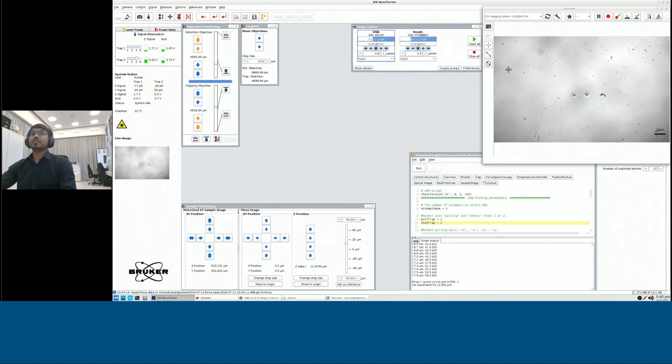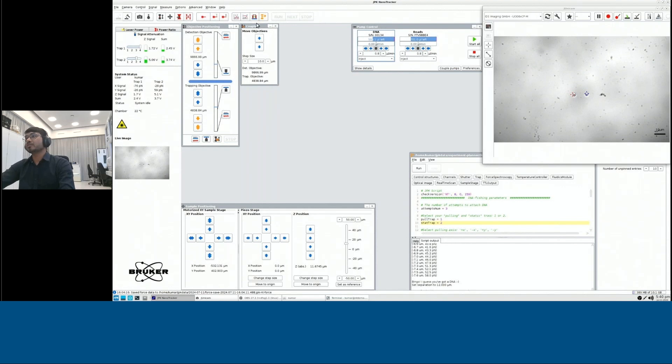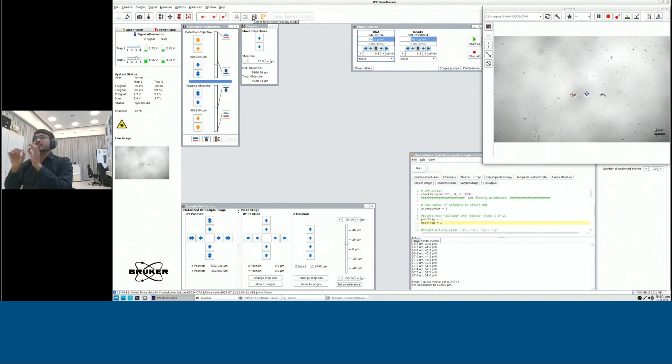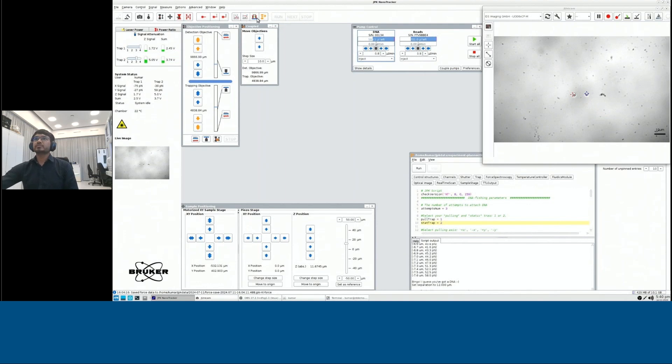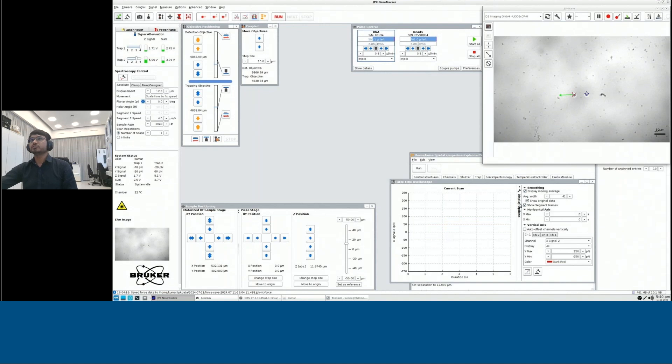Then we also have different functionality. One functionality that I would like to show is called force spectroscopy because we want to stretch our DNA and then measure the forces acting on it. So the function that you have is called force spectroscopy that I could show you here.